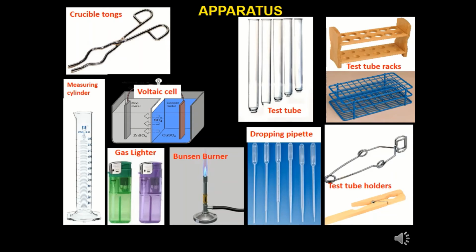So we squeeze it, which means there is air inside. We press it, squeeze the air outside, and then we dip it into the solution and leave it. When we leave it, it will take air back, and with the air, it will take the solution as well. Then we can squeeze again. Accordingly, we can deliver the drops.